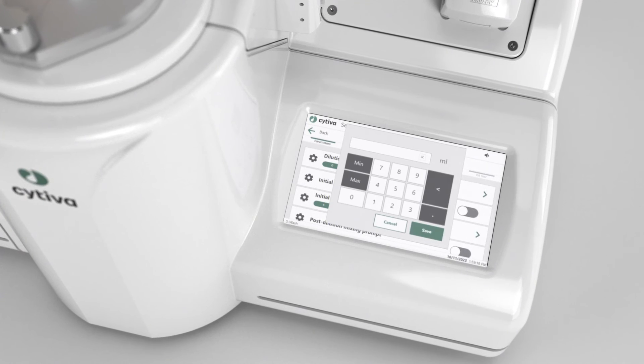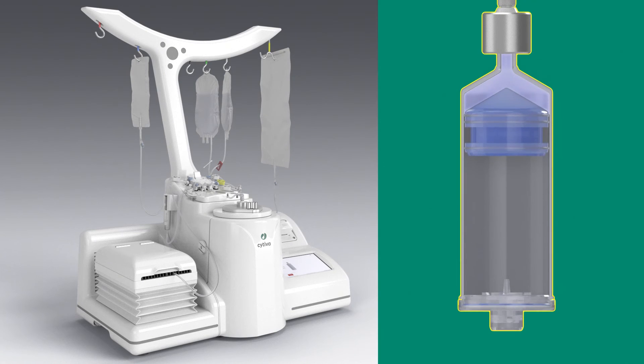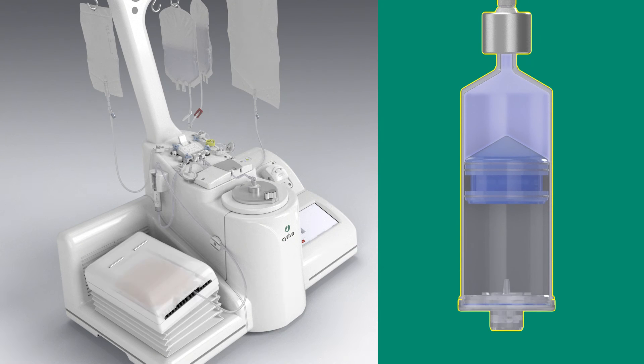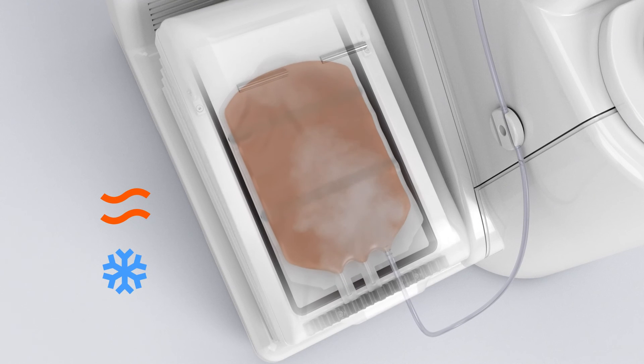You can activate initial dilution for thawed cellular products. The separation chamber extracts a defined volume of washing solution into the initial bag, which is placed in the thermal mixer to control the temperature and mixing.